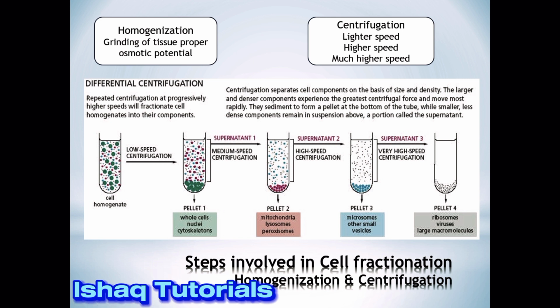When we spin the centrifuge machine at lower speed, two components within the test tube are separated. One is known as the pellet, as you see here in the diagram. The pellet, which is also known as precipitate, stands for the concentrated particles in the test tube after centrifugation.